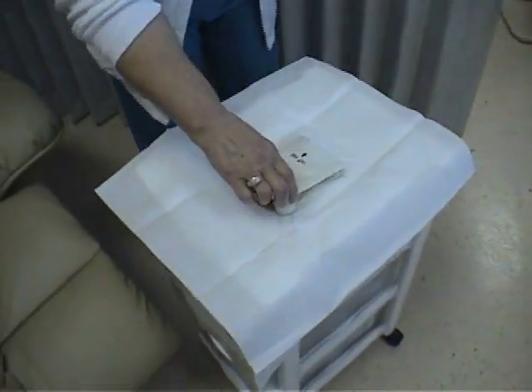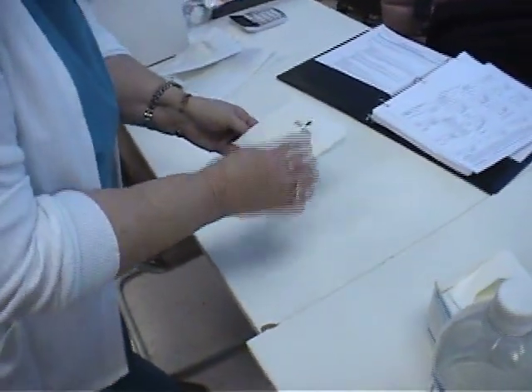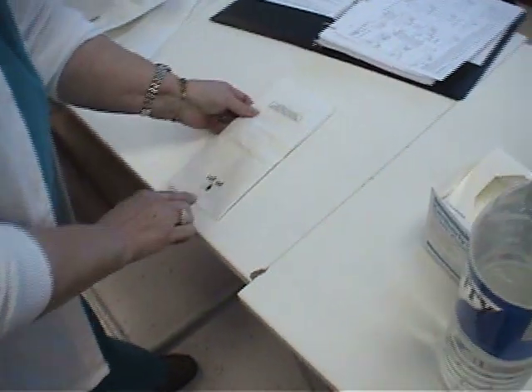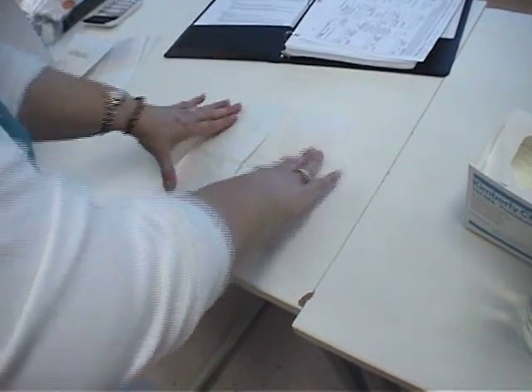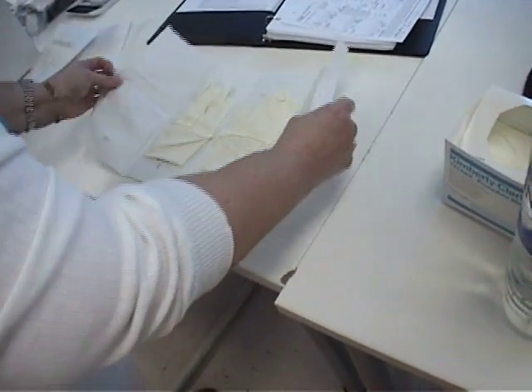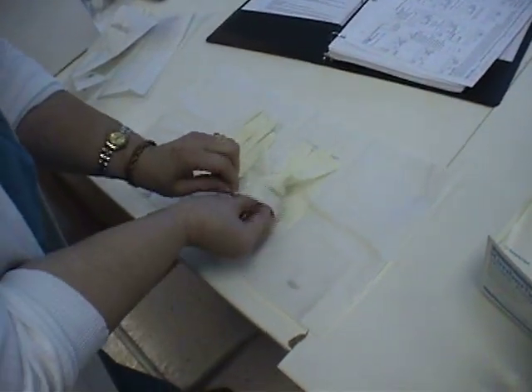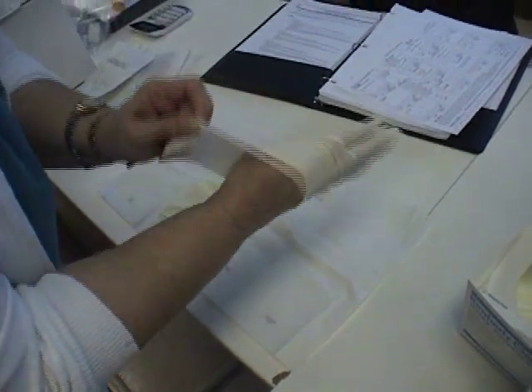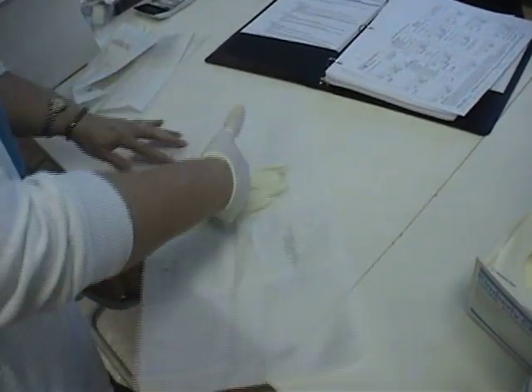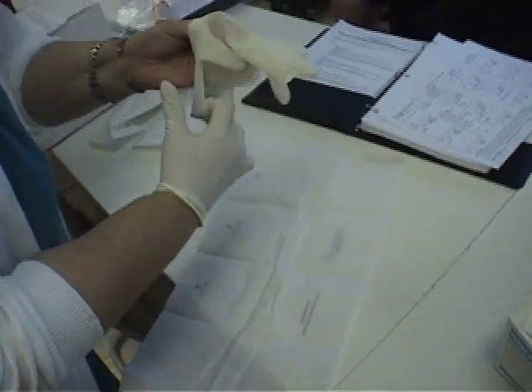Okay, we're going to pick up our new gloves. We're going to come over to the table and do the same thing. Cuff end down towards us. Cuff end down. Open up. Press the edges down. Pick up by the inside cuff. Put the fingers in. Go under the cuff. Put the fingers in.